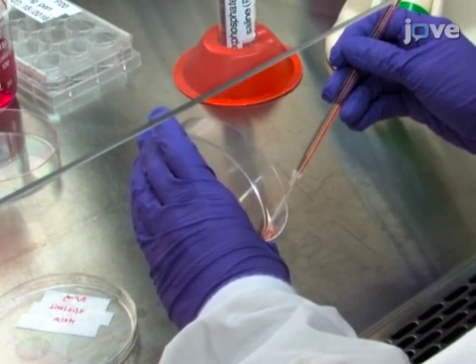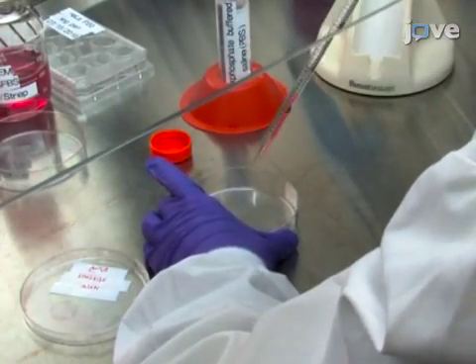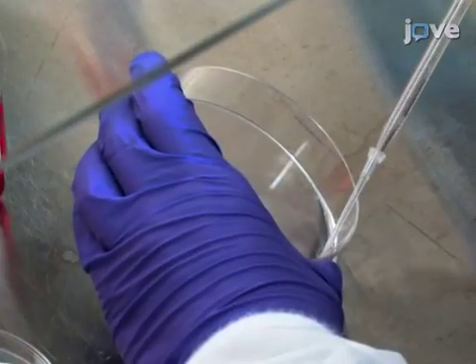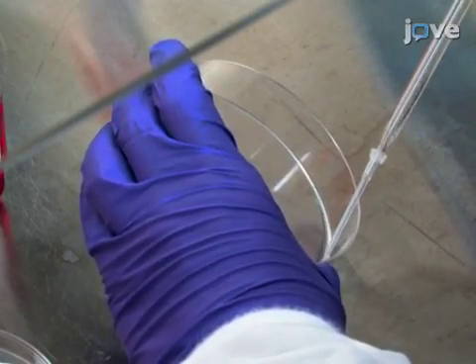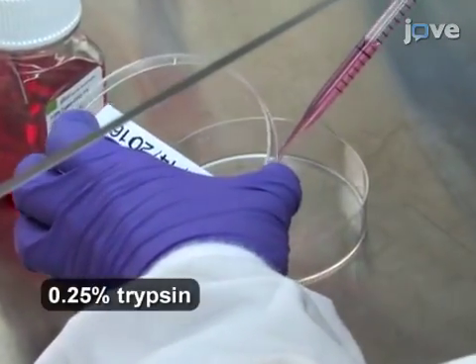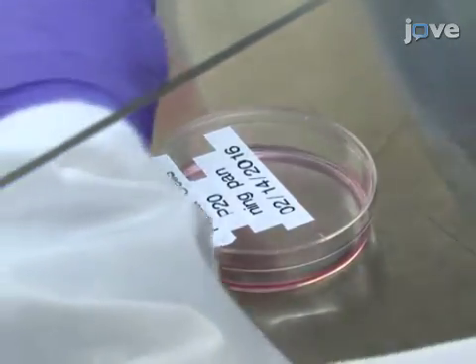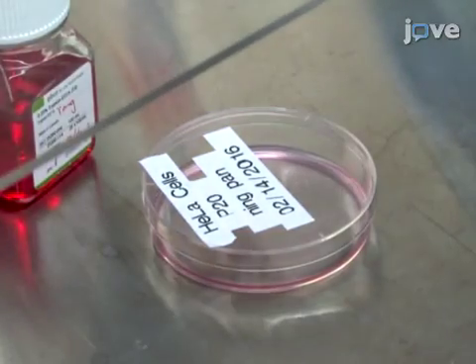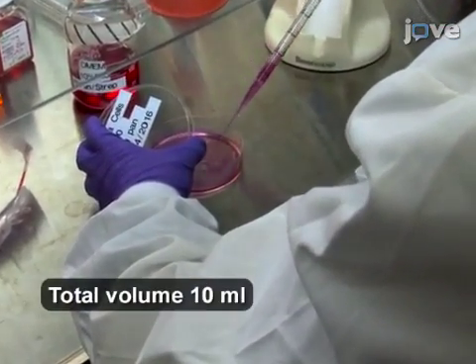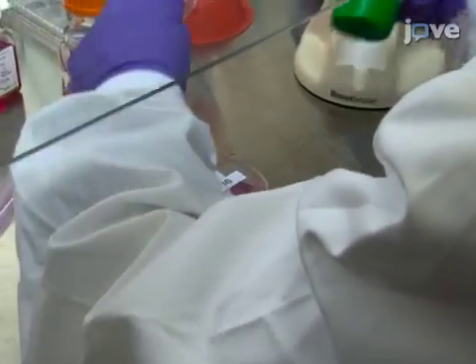To perform cell passaging, aspirate the growth medium and rinse the cells with 5 milliliters of 1x phosphate-buffered saline. Remove the PBS using a sterile aspiration tip and incubate the cells with 2.5 milliliters of trypsin for approximately 5 minutes at 37 degrees Celsius to detach the cells from the culture plate. Stop trypsin activity by adding 7.5 milliliters of complete cell culture medium and then uniformly resuspend the cells.